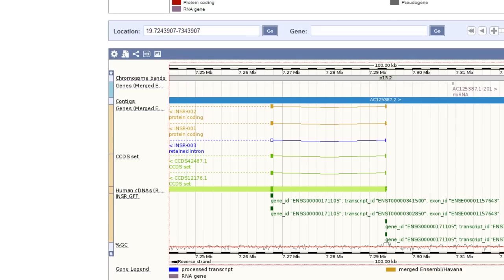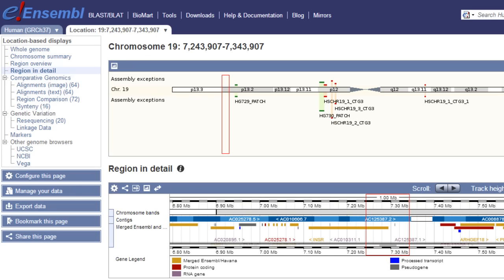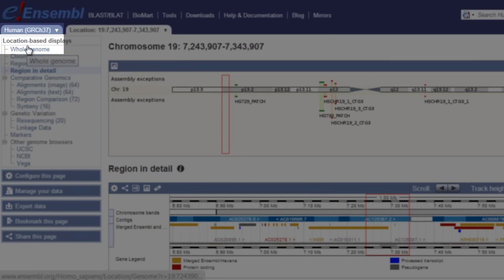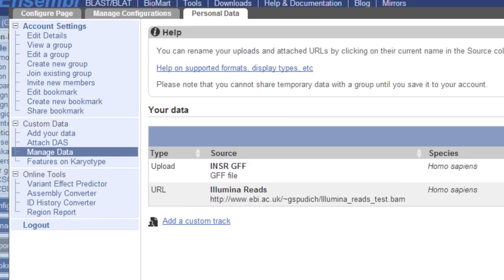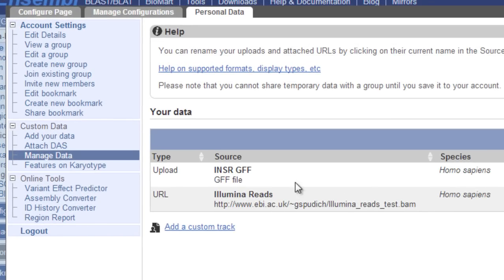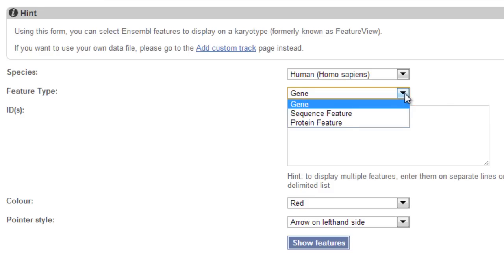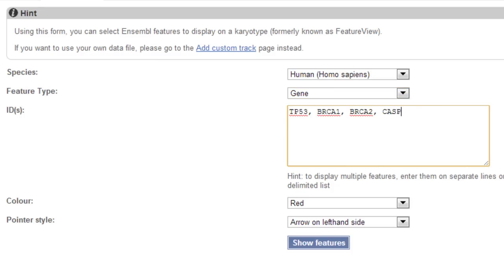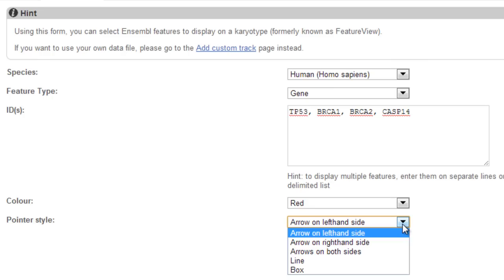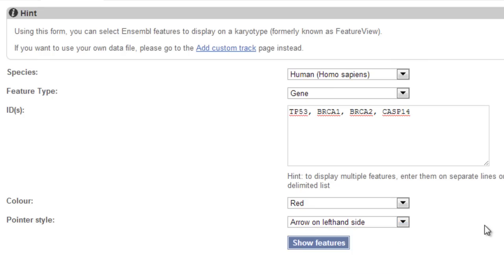There are other views I can see my data in — for example, the karyotype. If I click on Whole Genome, then Manage Your Data, and then Features on Karyotype, it gives me options to paste in some IDs or gene names. Note there are other types of IDs it will accept. I can go with the default or choose a different color or styling. You may want to choose red for one data set and then blue for a second to compare them, for example.